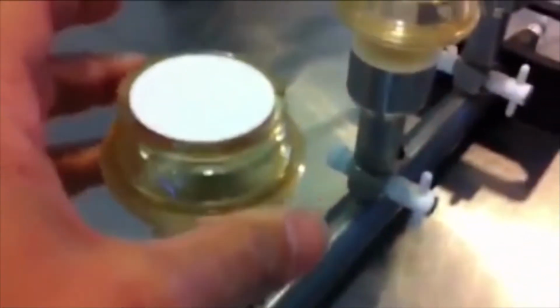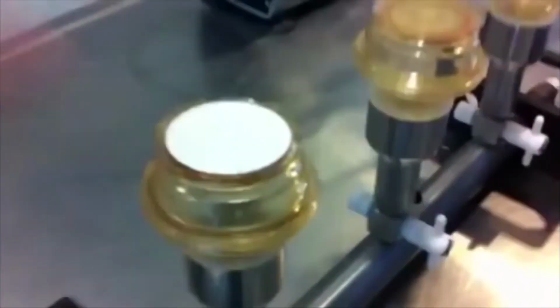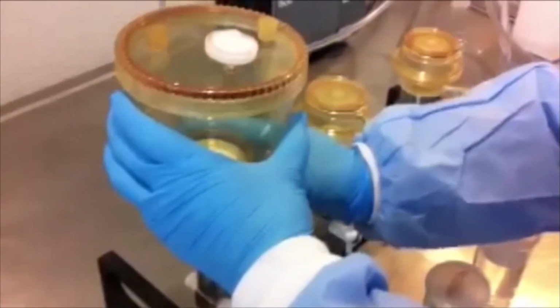So we're starting by putting the membrane filter onto the frit. This is called the frit. And this is an adapter that goes onto the manifold. Then we attach the funnel to the frit, which is holding the filter, and we do the same for the other two.